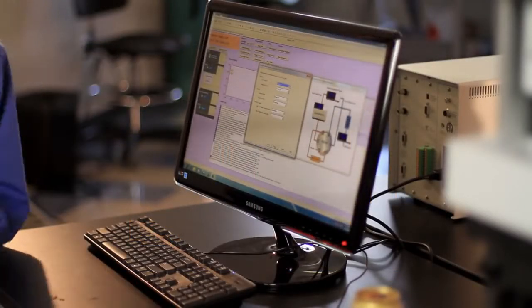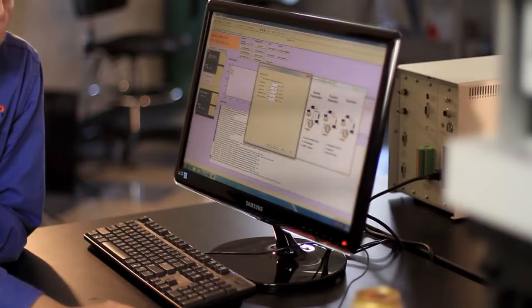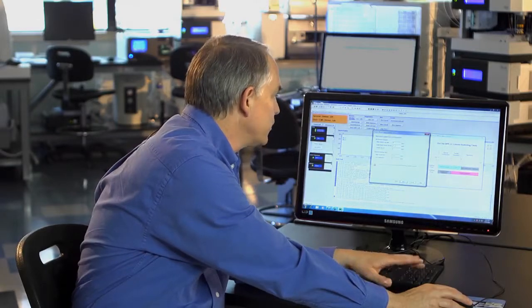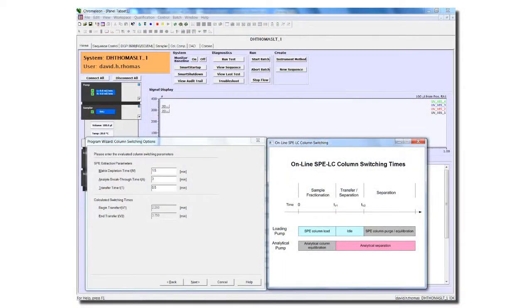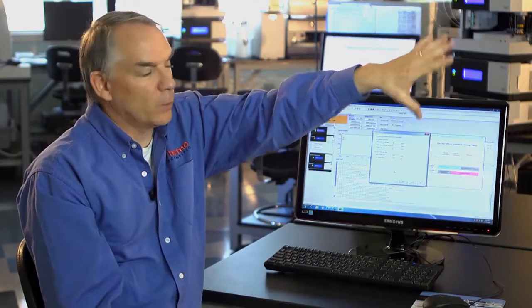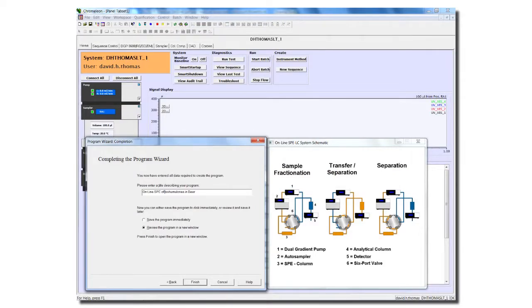And again now all we have to do is choose a few boxes to let the system know exactly how we're going to set this up. Tell it what temperature control we want to use. Here's where we put in those three parameters and I've optimized these beforehand so I can just go ahead and enter five minutes for the matrix depletion time, a time for the analyte breakthrough, the transfer time. And it automatically calculates the switching times for the valve. So once we've entered those three parameters we really don't have to do anything else. It knows when to switch the valve. It's going to know when to run the gradient programs for each pump. We're really all finished at this point and the rest of the program really is just the basic things that you would enter in for detection and the final method.